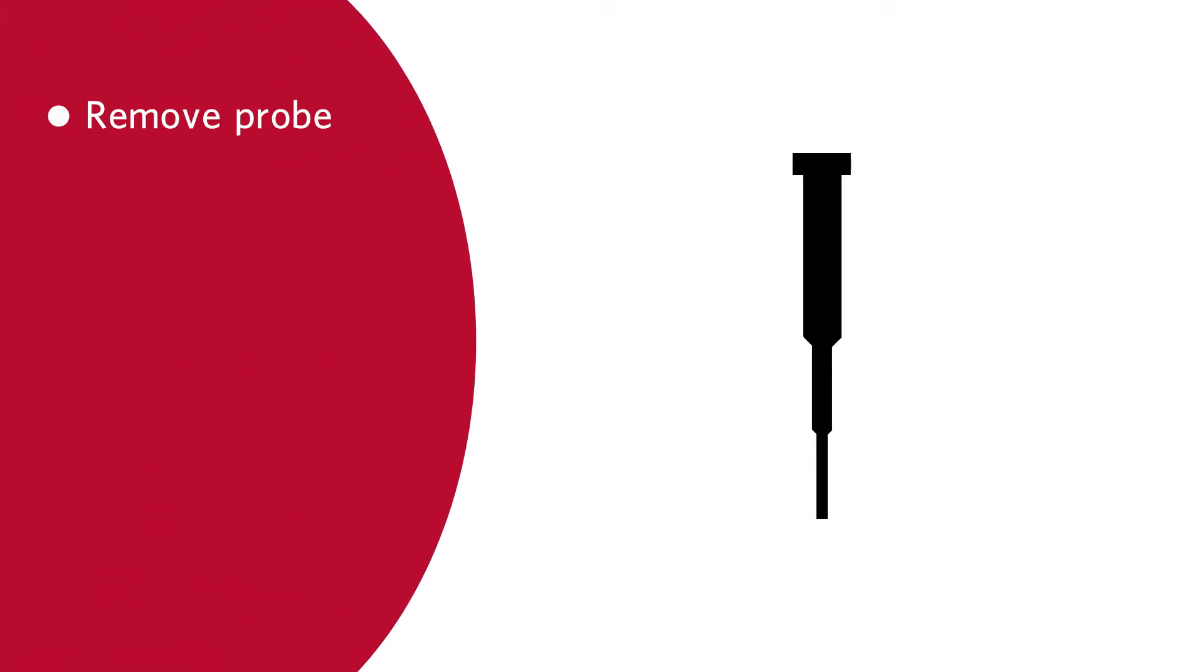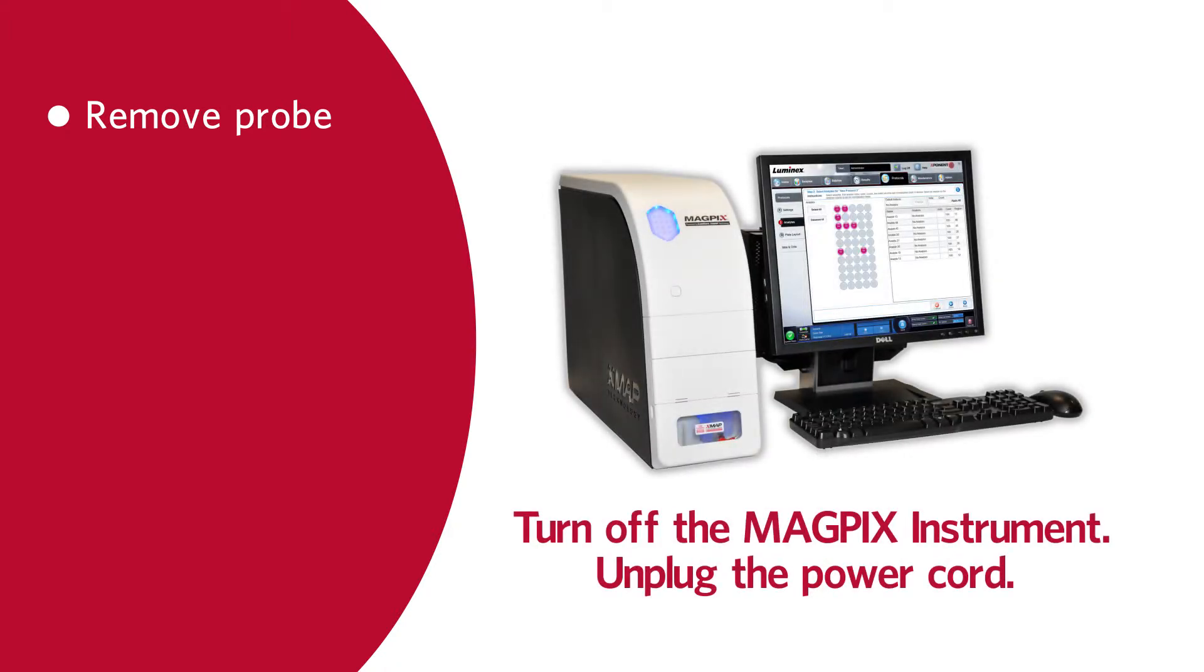To clean the sample probe, remove the probe from the instrument. Please note, turn off the MAGPIX instrument and unplug the power cord before attempting this maintenance procedure.